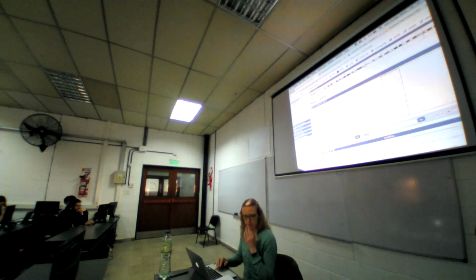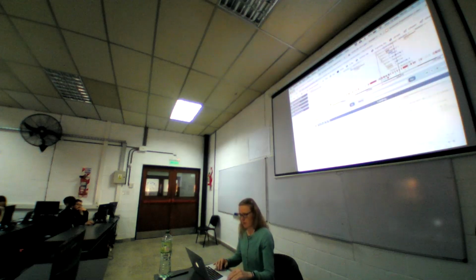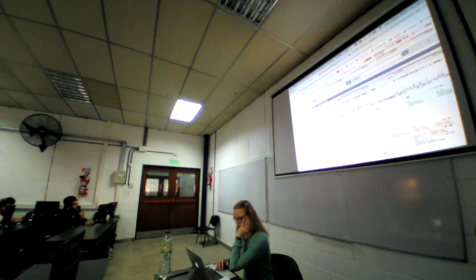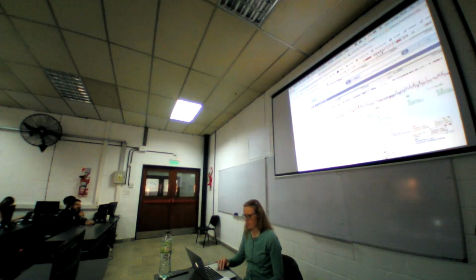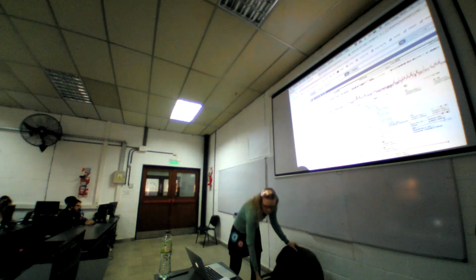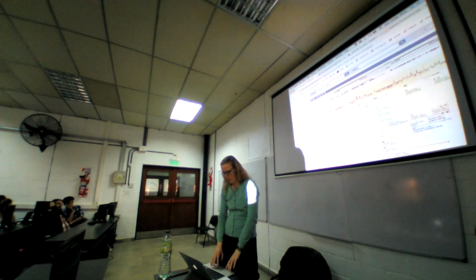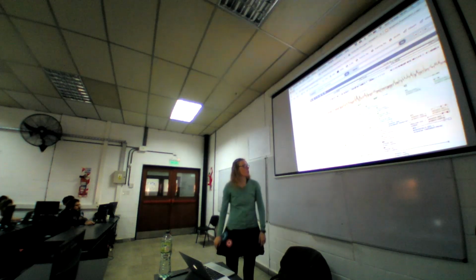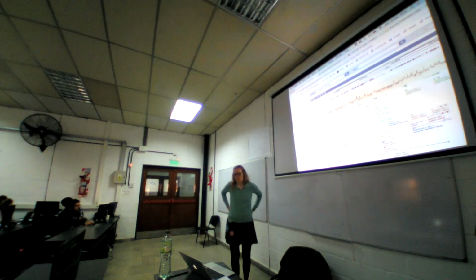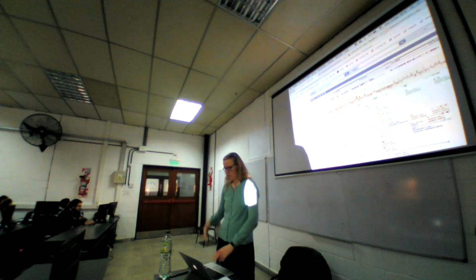And have a look at the result. So let's start at the top. We have two tracks there in pink now, which are related to conserved regions. This one here, with the positive and the negative scores. This is raw data signals related to conservation of individual nucleotides there. So positive means conserved, negative means not conserved.